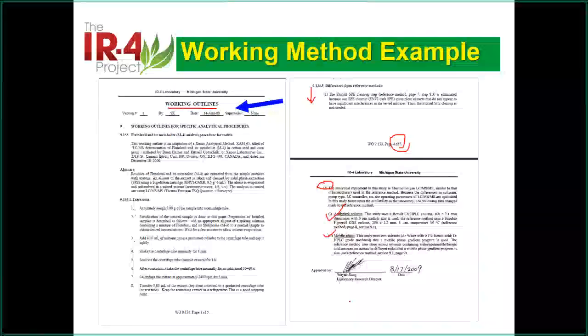If you change a small portion, for example, the percentage of formic acid from 0.05% to 0.1%, that is okay. That's small. But if it totally changed from a water methanol system to like a hexane system, then it's not working. So it depends. So we put a big question mark here.